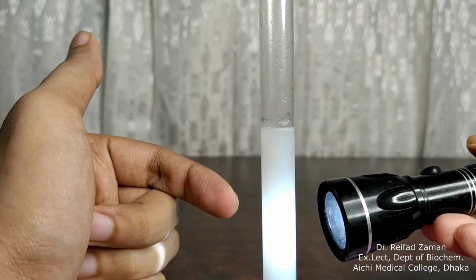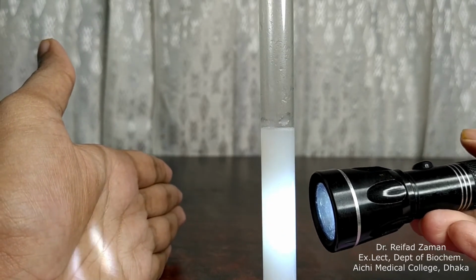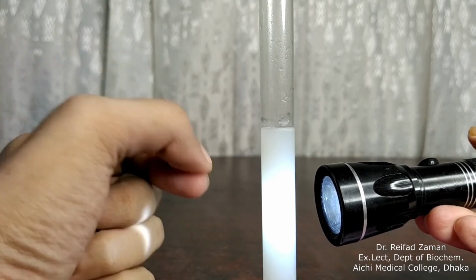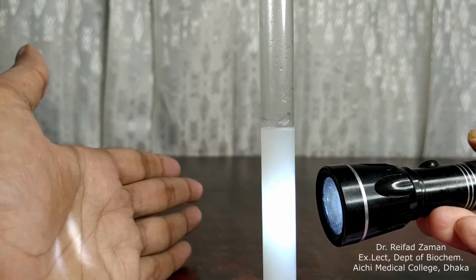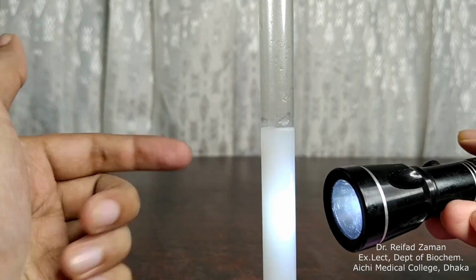As you can see যে এই লিকুইডটা কিন্তু লাইটটা রিফ্লেক্ট করে দিচ্ছে। লাইটটা কেন রিফ্লেক্ট হচ্ছে? বিকজ এইটার মধ্যে although it's not visible through our eye, but মিল্ক পার্টিকেল গুলা কিন্তু এখানে ঠিকই আছে। And এর আগের বার ক্রিস্টালয়েড যখন ছিল, তখন যেহেতু এটা একটা সবাই সেম ফেজে ছিল, so light could easily pass through them.